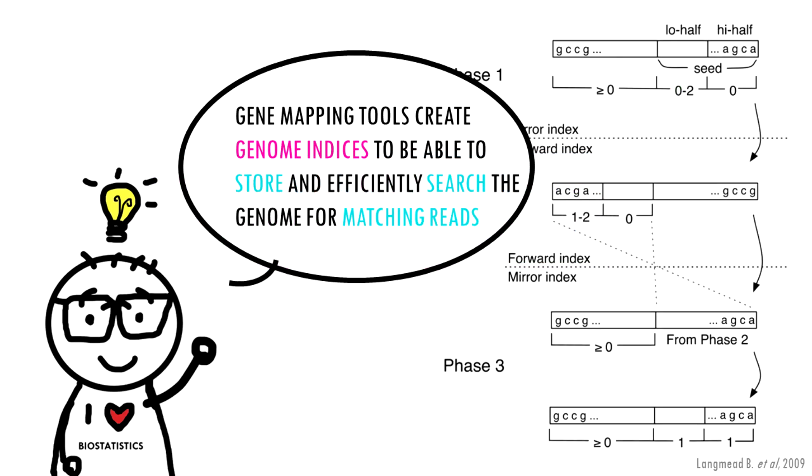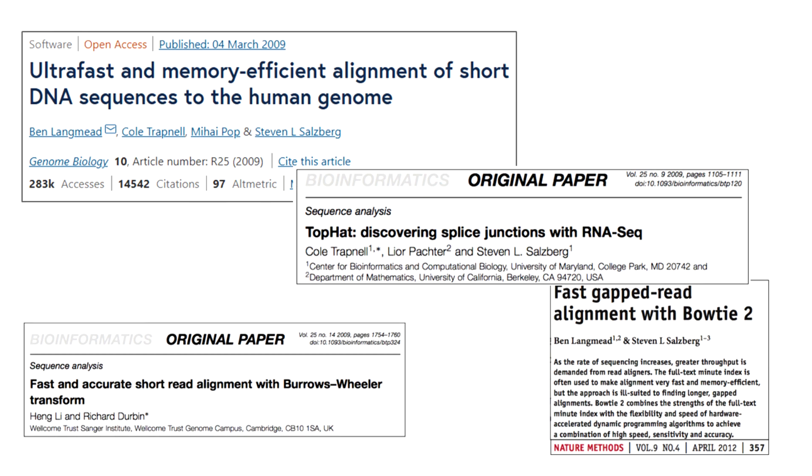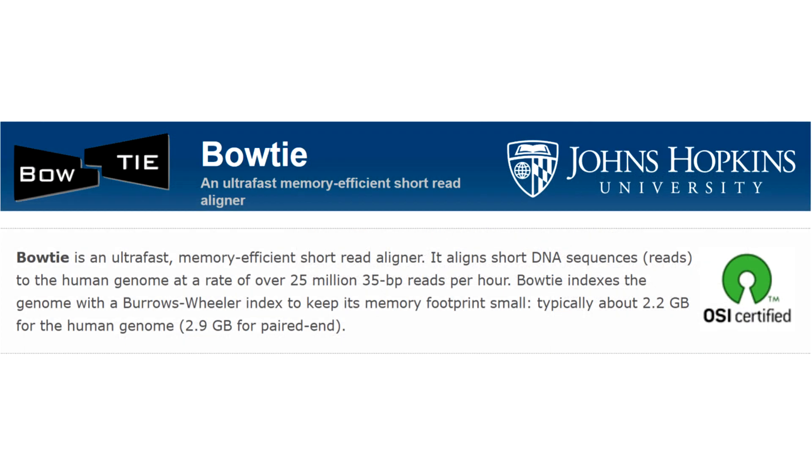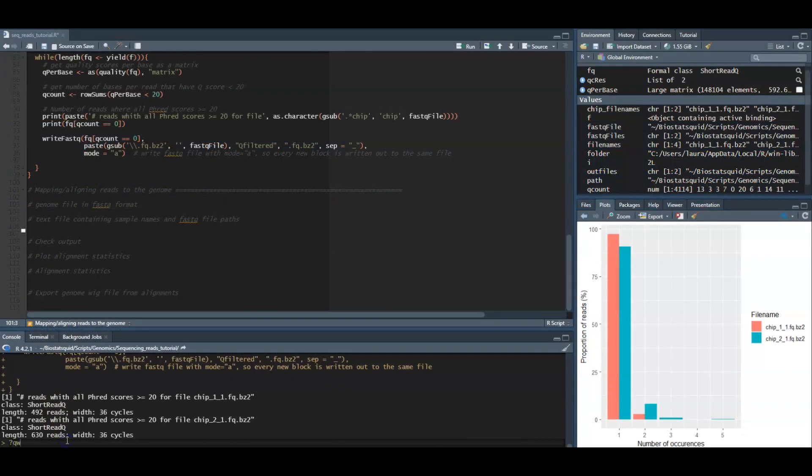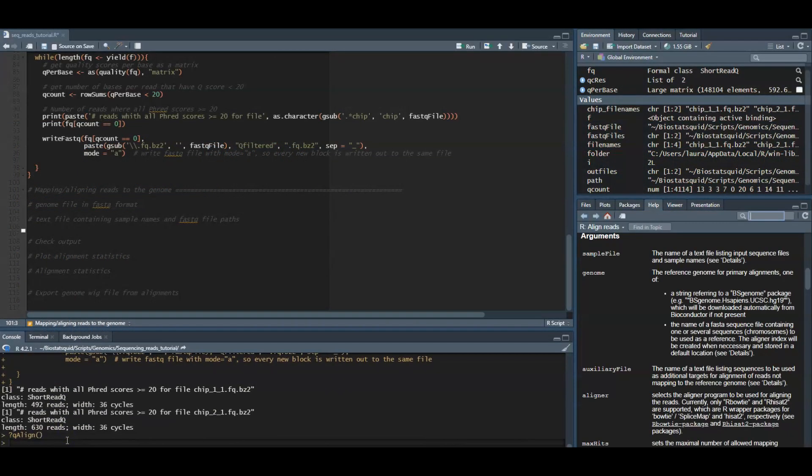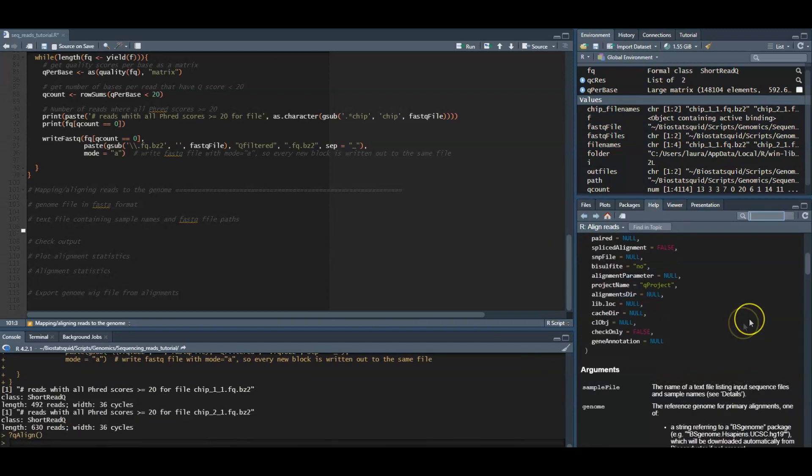To be more time and computationally efficient, these algorithms essentially create genome indices to be able to store and efficiently search the genome for matching reads. We will not go through the details of the different algorithms that are available out there, but we will use a Bowtie aligner from the Rbowtie package, which is quite fast and memory efficient. We will use the qalign function, which requires two mandatory arguments.